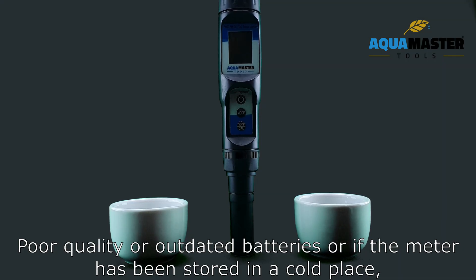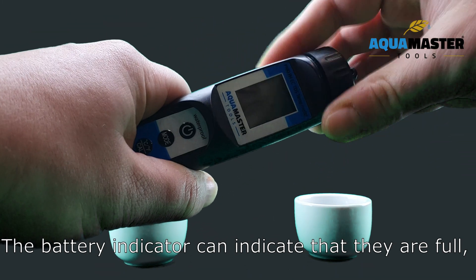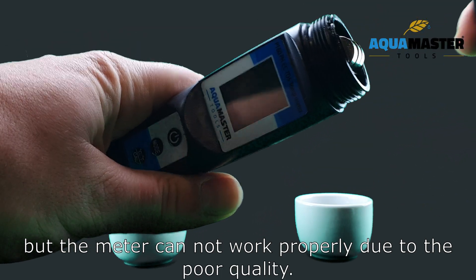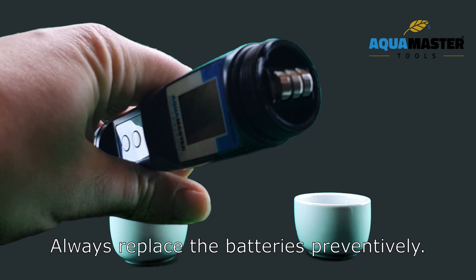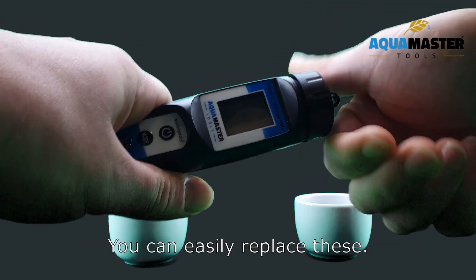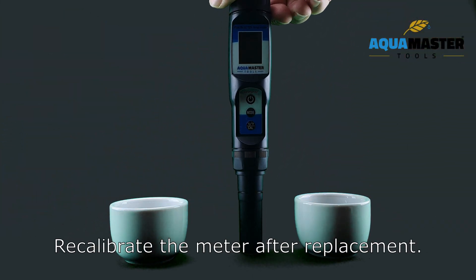Poor quality or outdated batteries, or storing the meter in a cold place, can deteriorate battery quality. The battery indicator may show full, but the meter cannot work properly. Always replace the batteries preventively. The meter contains three 1.5-volt batteries which you can easily replace. Recalibrate the meter after replacement.